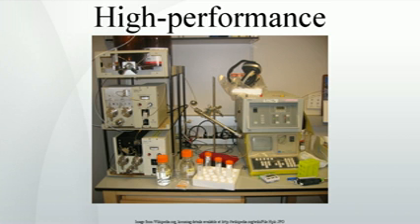It is the space within the column that is outside of the column's internal packing material. Void volume is measured on a chromatogram as the first component peak detected, which is usually the solvent that was present in the sample mixture. Ideally the sample solvent flows through the column without interacting with the column, but is still detectable as distinct from the HPLC solvent.